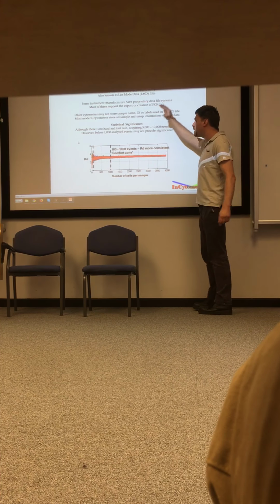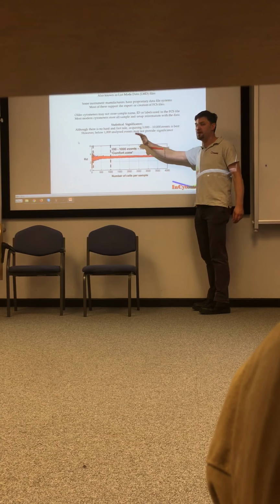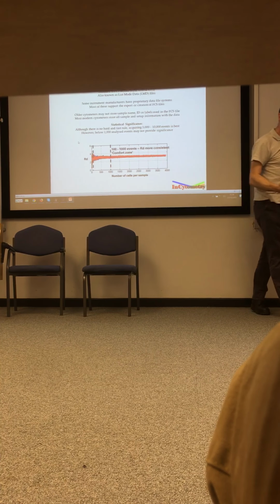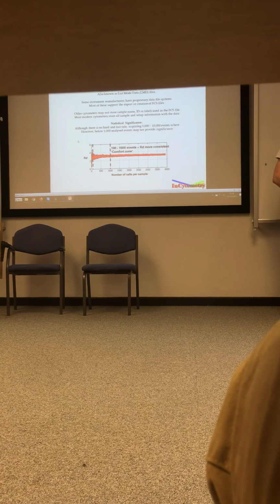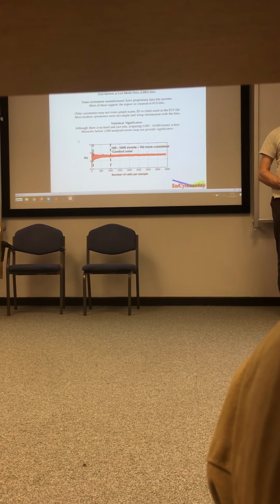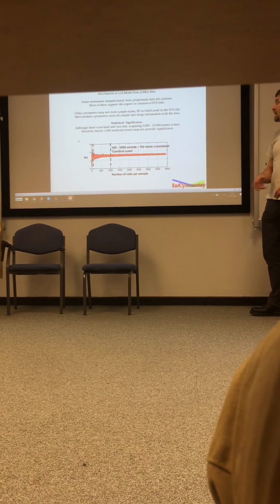So I'm not going to go over data files again, but in terms of acquiring events, how many do you need for statistical significance? How many do people tend to acquire? 5,000 anyone? 10,000? Yeah? More? Anyone acquire big files? What sort of numbers? 100,000? 500? That sort of thing? Yeah? Well, sometimes you have to.